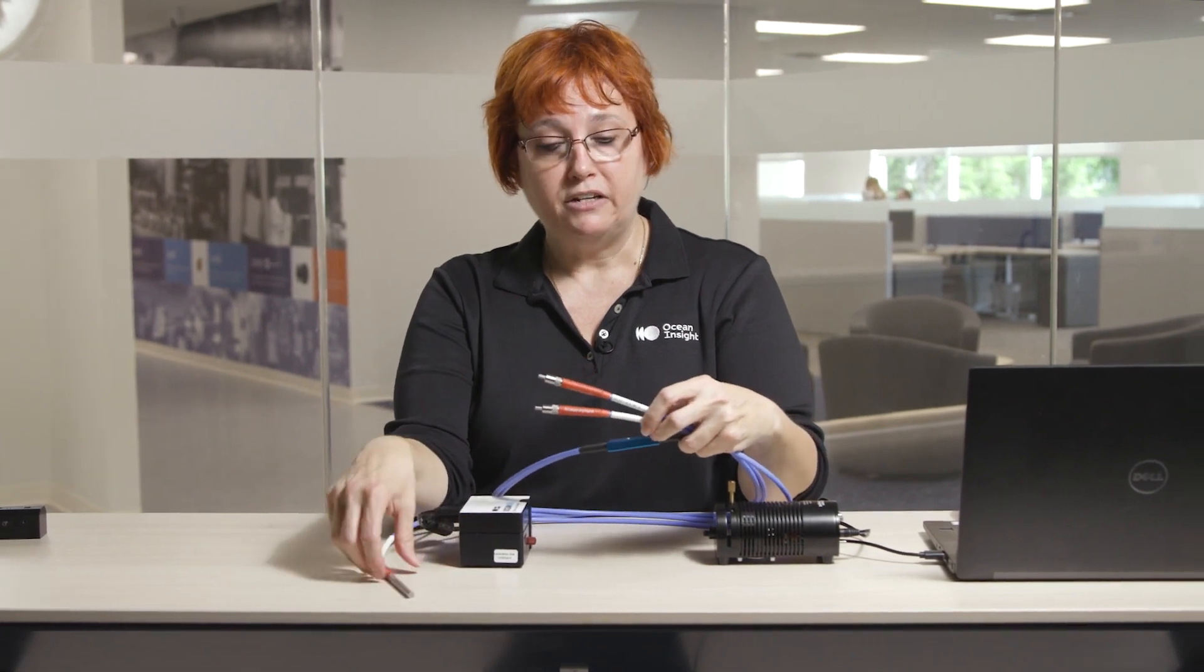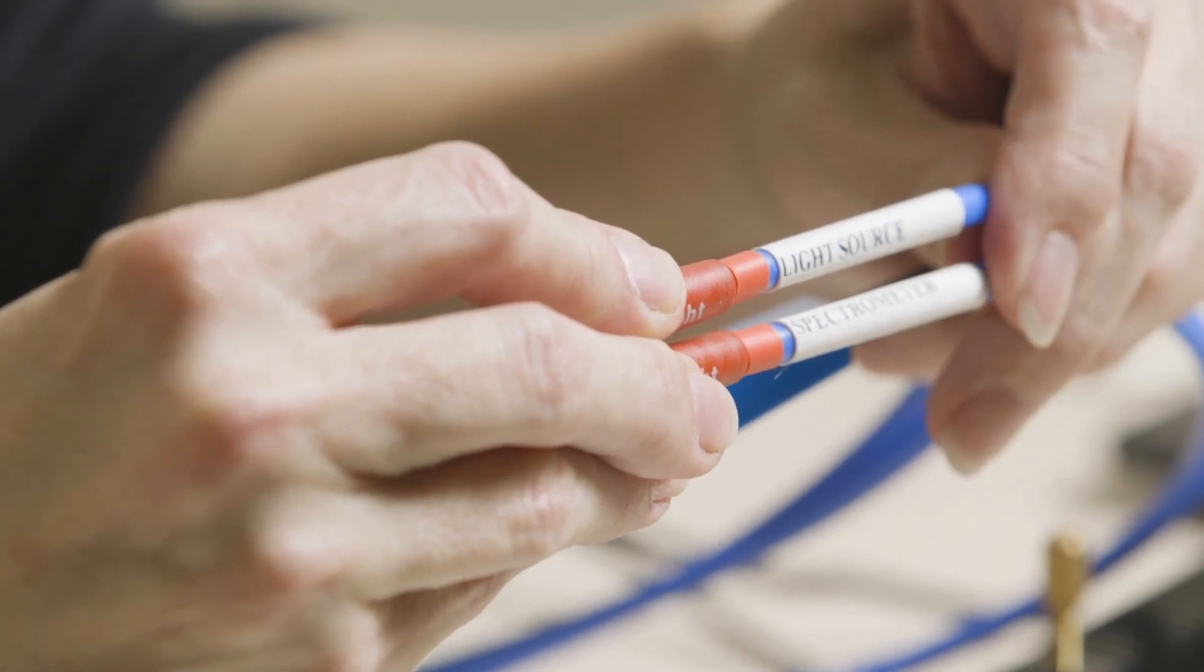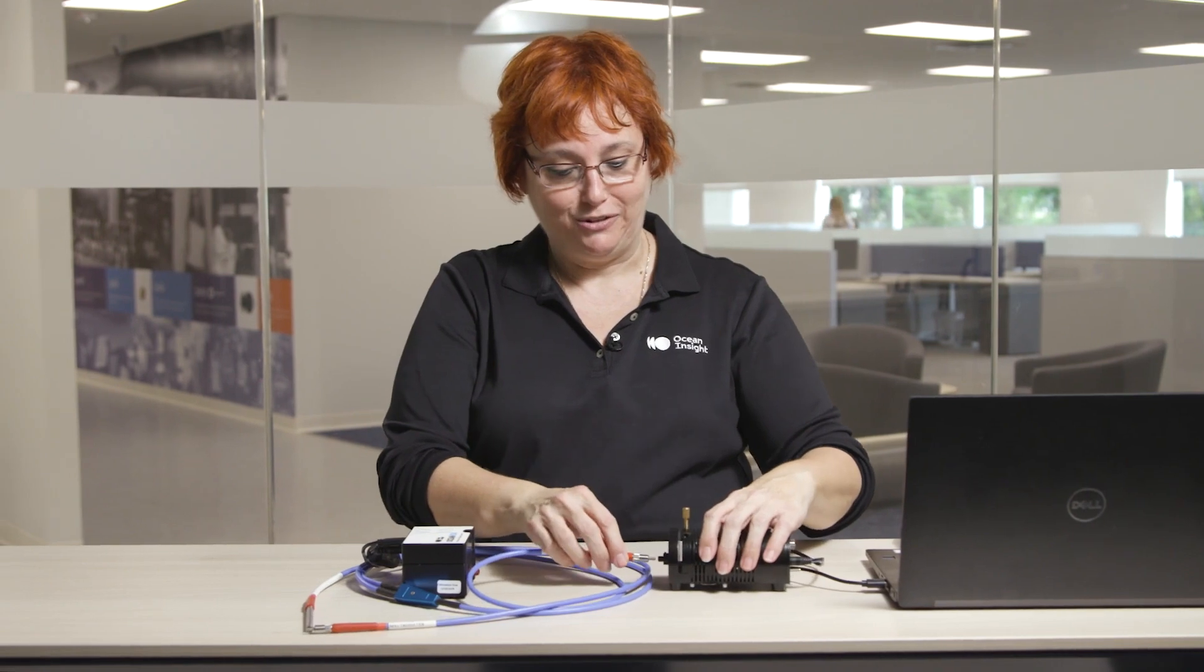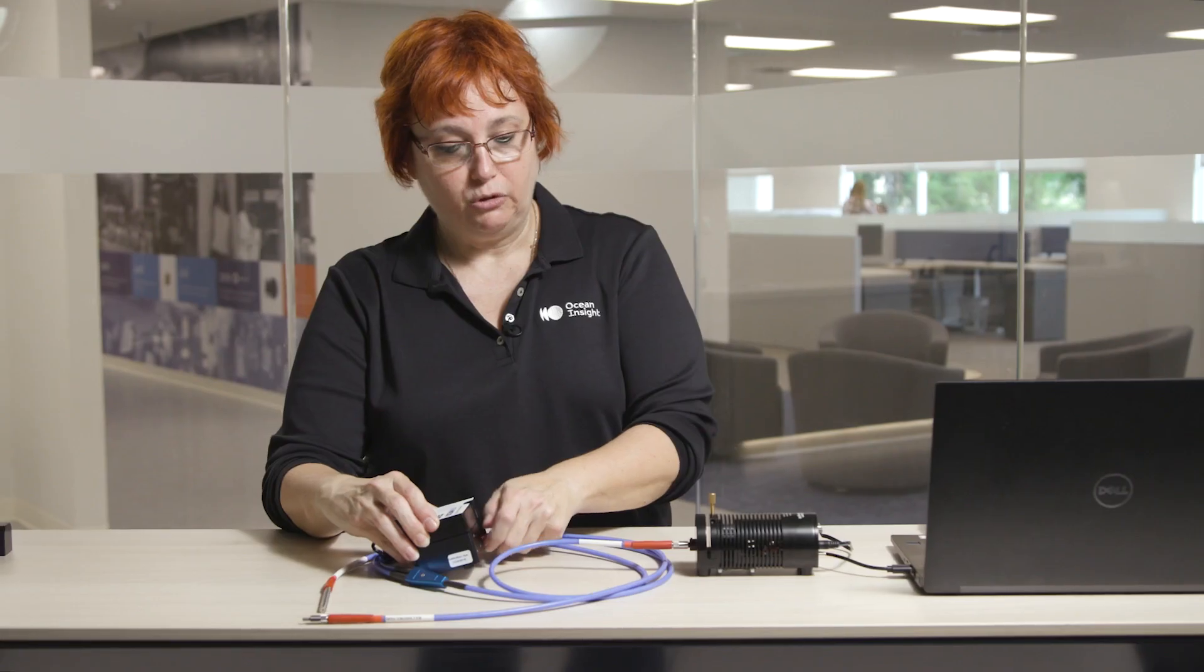The other end of this assembly has two different fiber legs. We're going to take our light source leg and we're going to connect that to our light source. The spectrometer leg is going to go to our spectrometer.